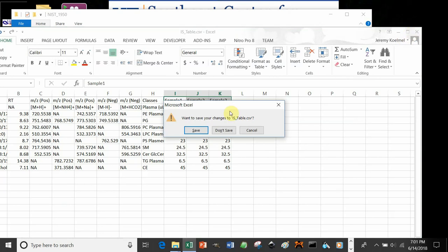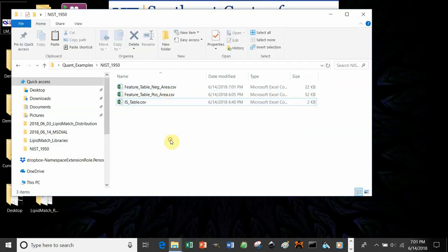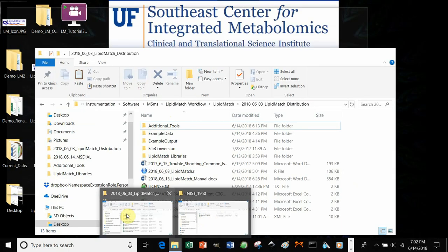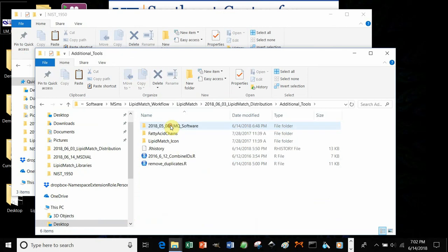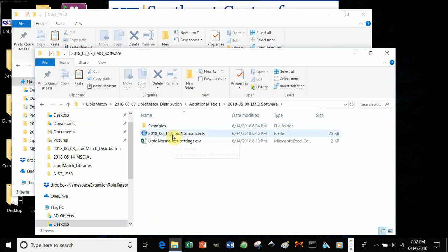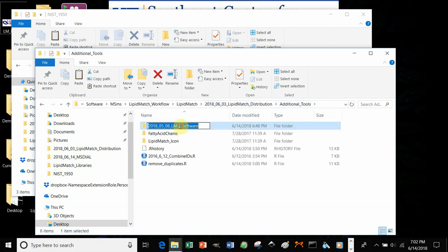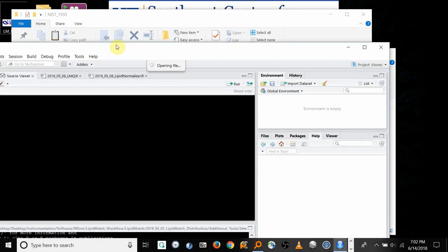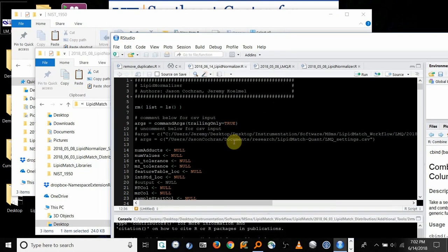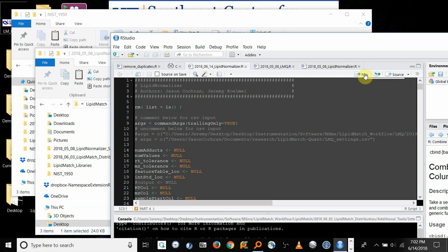After you've created your internal standard table and have your feature tables, you can run LipidMatch Quant — or LipidNormalizer. If you go to your LipidMatch distribution or download LipidMatch Quant directly from the CSIM webpage, it's available in additional tools. Find your LipidNormalizer R script, double-click it, press Ctrl-A, and click Run. This will bring up the GUI interface.